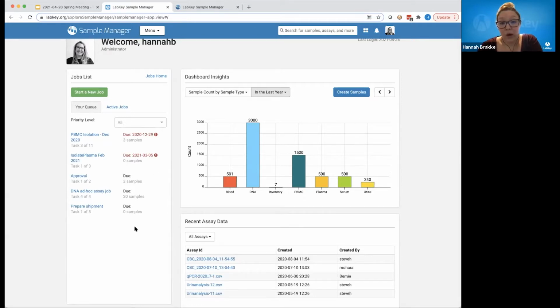We have the list of work that I'm meant to be doing. So all of these things here have been assigned to me. I'm fairly delinquent on a couple of them, and luckily some of them don't have any due dates. But it gives me a sense of the priority. And you can imagine if I was in a real lab, I've probably got way more than 5 workflows on my plate. And so I'd be able to look at these based on priority level and say, oh, really somebody's given me a high priority item to work with. And so I'm going to start there for the day.